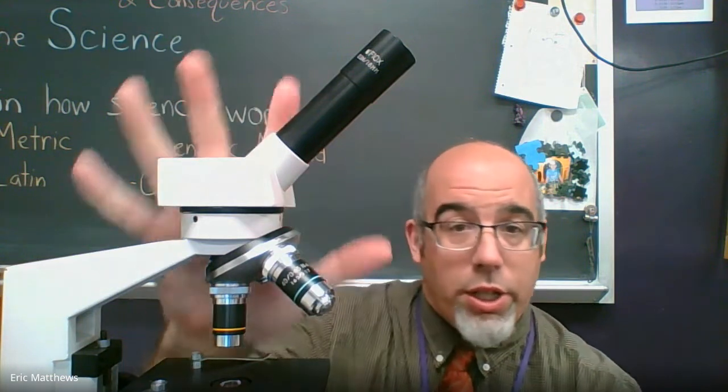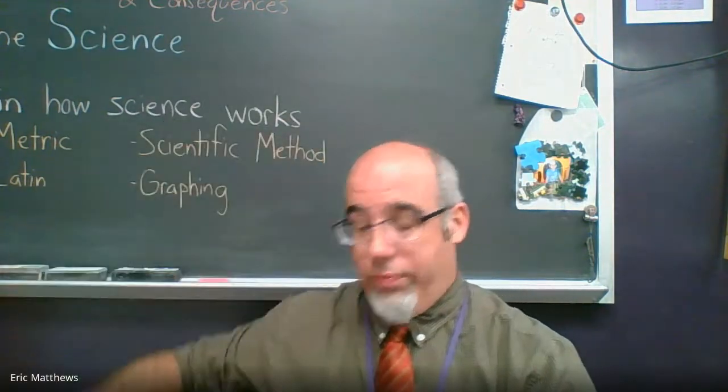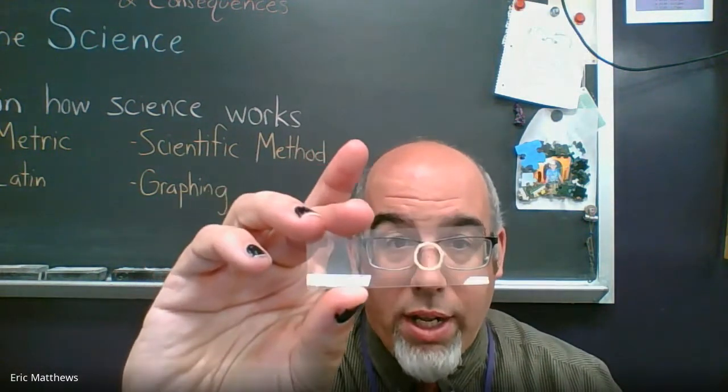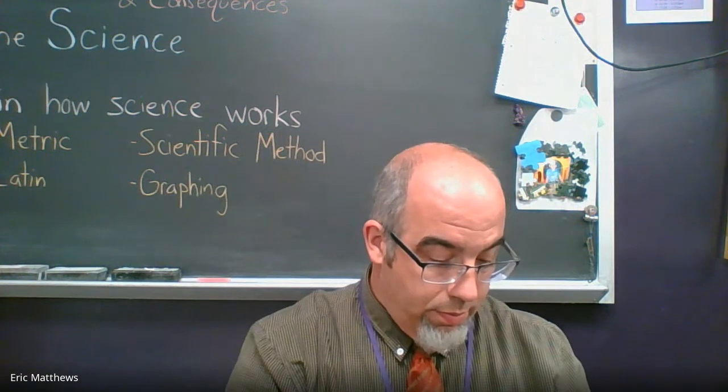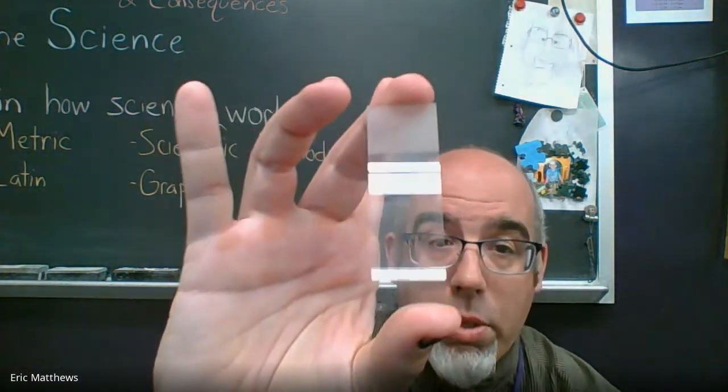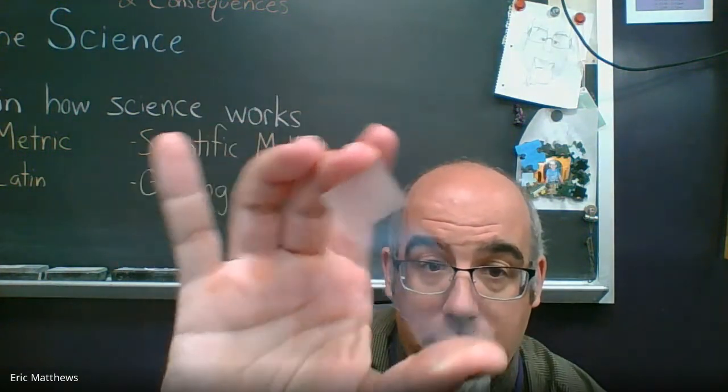All right, so using the microscope, we are going to want to take a look at our cheek cell. So let me show you how we're going to do that. First thing you want to do is make sure to get the right slide. If you pick up a slide and it has something on it, that's wrong. This one is a prepared slide. This is not what we need. What you want is an empty slide. All the tables have these. And this is going to be an empty glass slide that has nothing glued to the middle of it.